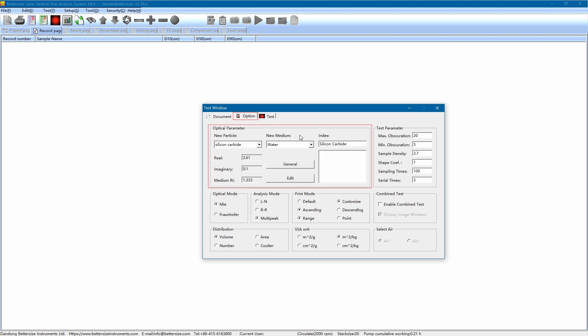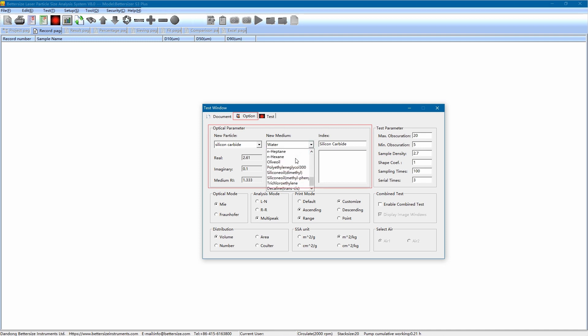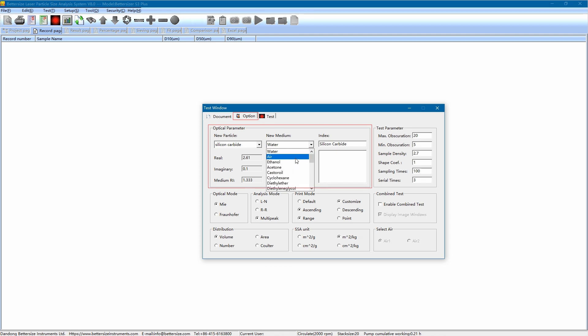As for the dispersion medium, it is to make the sample in a uniform, dispersed, and easy-to-transport state. Dispersion medium should be transparent without impurities, and make sure there's no chemical reactions between the sample and medium. There are many liquids that can be selected as the dispersion medium. For this measurement, we choose the most commonly used one, water. So, choose water as the dispersion medium, and the refractive index is shown here.